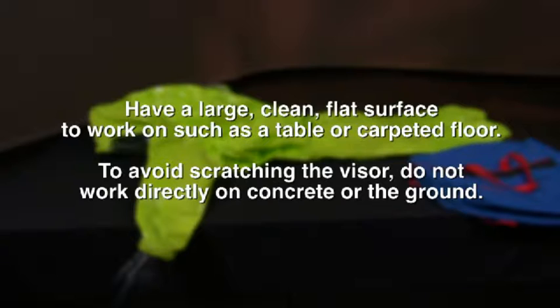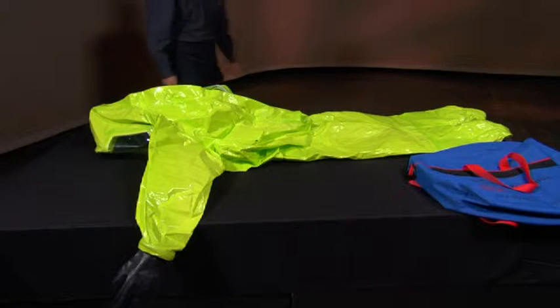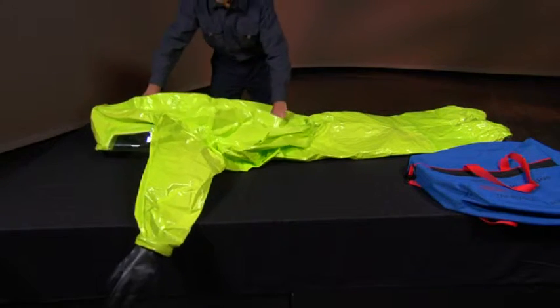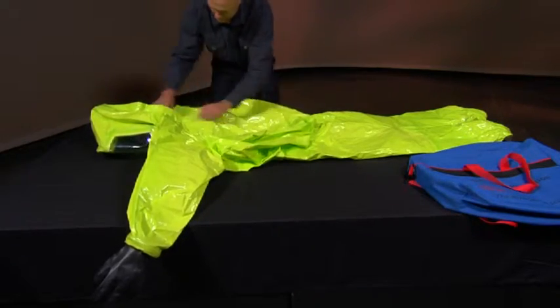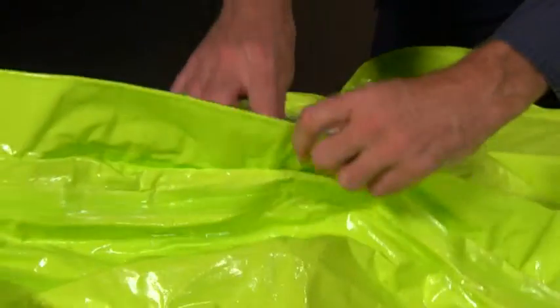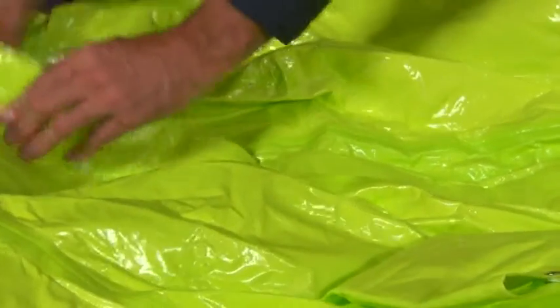To avoid scratching the visor, working directly on concrete or the ground is not advised. Expanded back suits should have the extra fabric in the back areas collapsed and brought into the edges of the body of the garment. The suit's zipper is normally left open during storage to facilitate expedient donning during incident response.